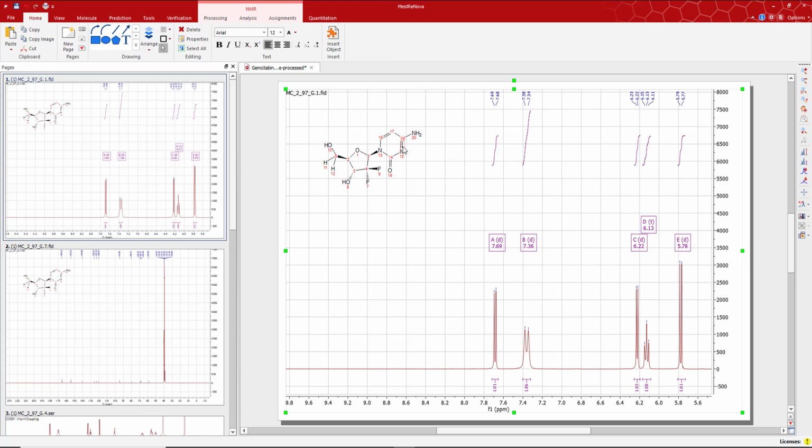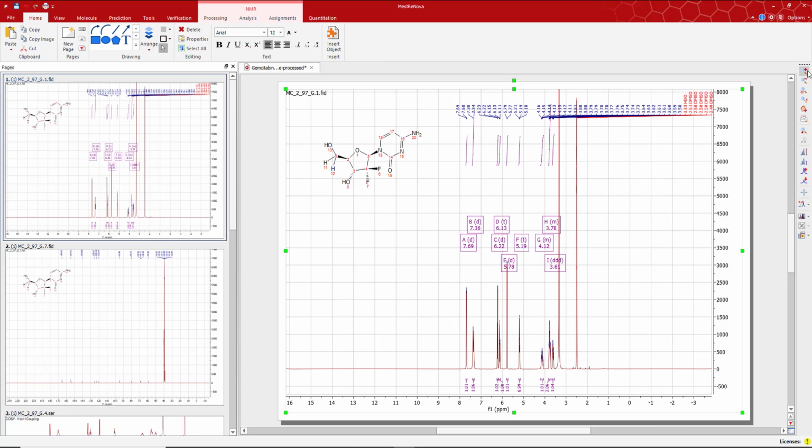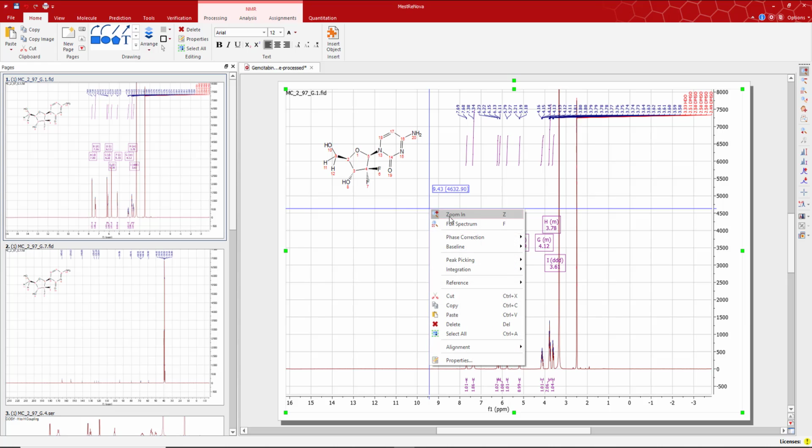These electrons in this pi bond here would move up to the nitrogen, and what that means is there's so much double bond character in this that these protons are actually spending a lot of time locked in place, not able to spin, and becoming diastereotopic. So that's the actual reason that this is showing up as a doublet, and in fact it's not a doublet, it's two 1H singlets. But that oddity aside, it's the only 2H signal I have not on carbon, and given my molecule, it's really the only possibility.